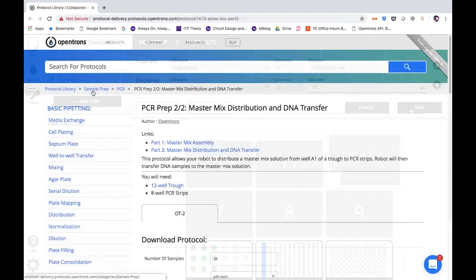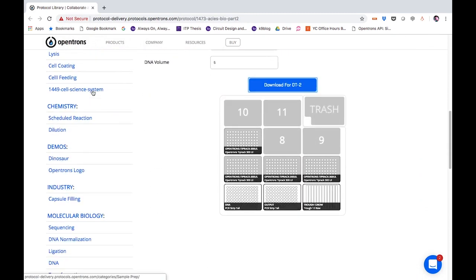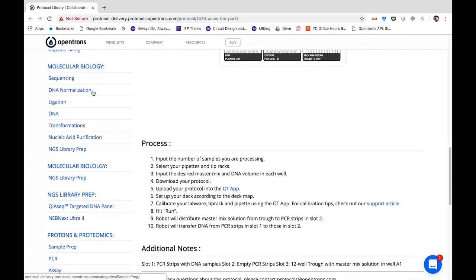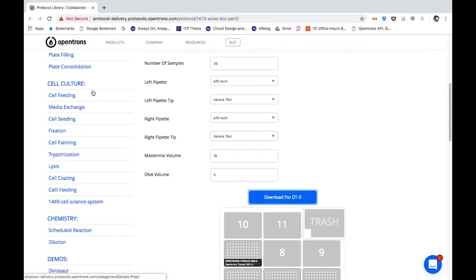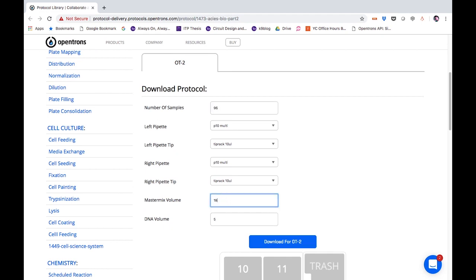Or, you can pick from some of our pre-made PCR prep templates on the protocol library. If your requirements line up with these templates, you can quickly get up and running with the protocol you need.